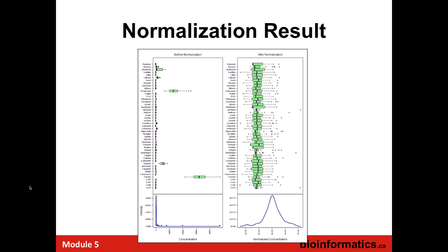So this is critical for doing statistics. As I said, if you didn't do this, you would be dealing with non-normalized data, and essentially all of your calculations would be grossly in error. Statistics was not designed to work with skewed distributions. It was designed to work with normal distributions.